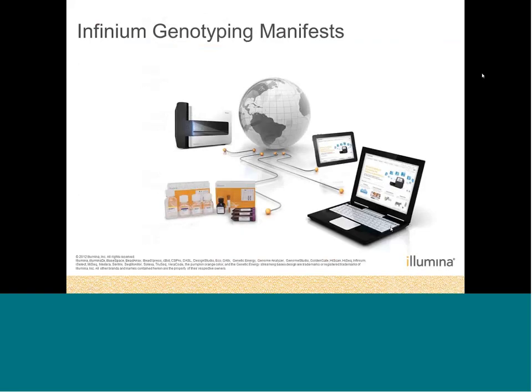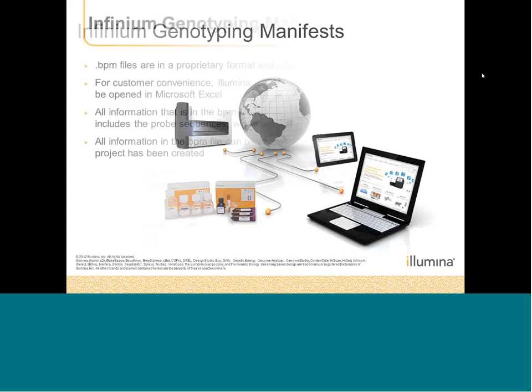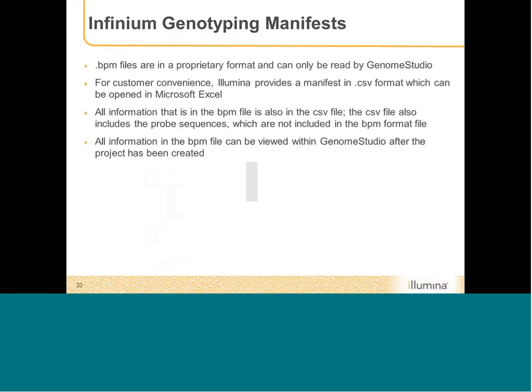All right? Now, hopefully we have a clear picture of how Illumina's top, bot, and AB genotype standards are assigned. Let's take a look at the Infinium genotyping manifest now, and it will become clear as we go along why this top and bot assignment is important.